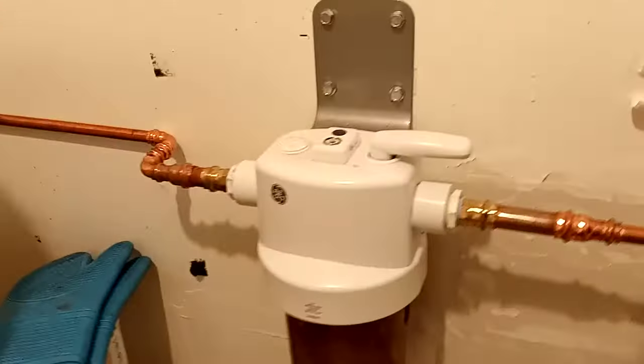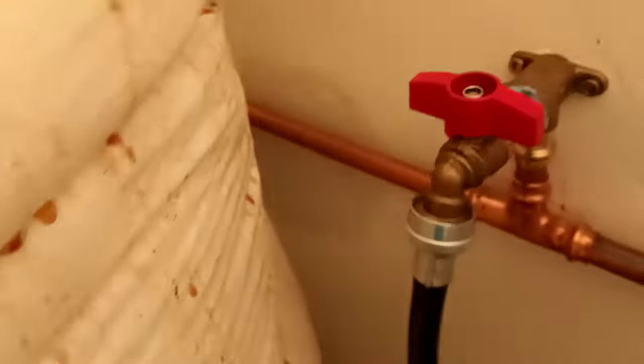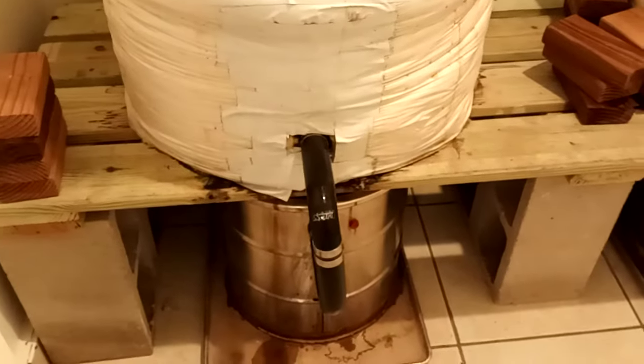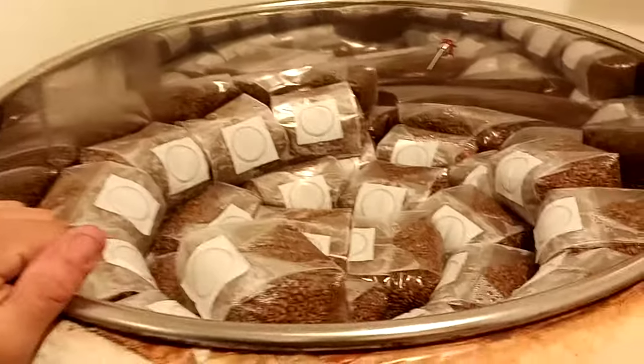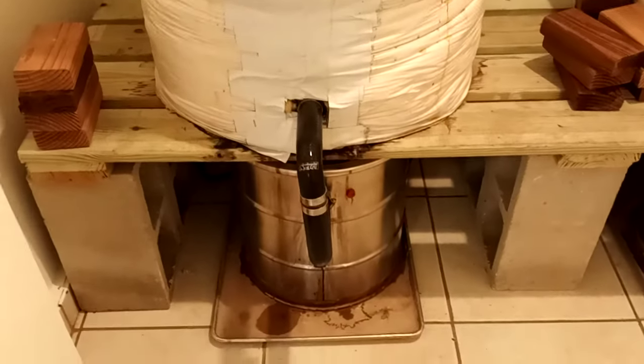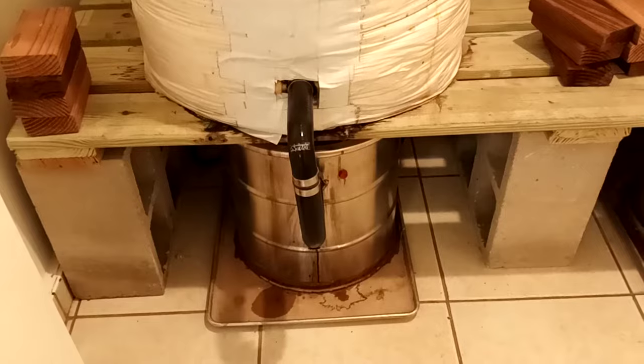The element heats the boiler and boils the water down there. These are hooked up to water lines as well — you can see the hard water line running in here. The boilers auto-fill and they're on float valves, so we pretty much just turn the water on and let them go. They actually work through very little water; if I'd known that at the beginning I probably wouldn't have even run water lines, because filling the 15-gallon boiler — it doesn't even run through that much water on a single run.